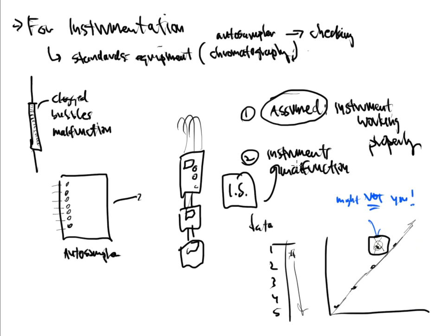Okay? Something that you have to keep in mind is that internal standards are given to the standards themselves to make a cal curve with. This helps us make sure that we get the best cal curve possible. And the internal standards are also incorporated in the samples. And this is to ensure that we are injecting the proper amount every single time. So the internal standards go to everything. Every single thing that you're processing, every single thing that you're running in that machine gets the internal standard spike or addition.